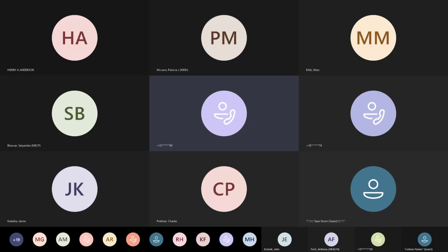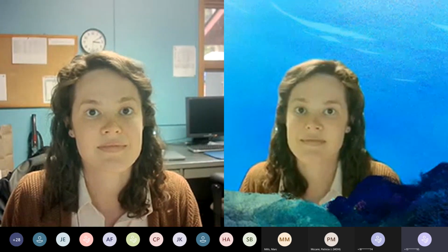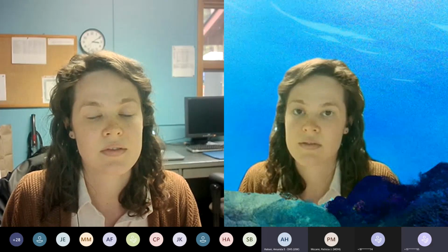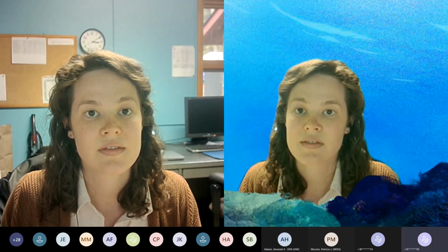and is our lead chemist for PFAS analysis, and Kat's going to talk about addressing extraction challenges for PFAS.